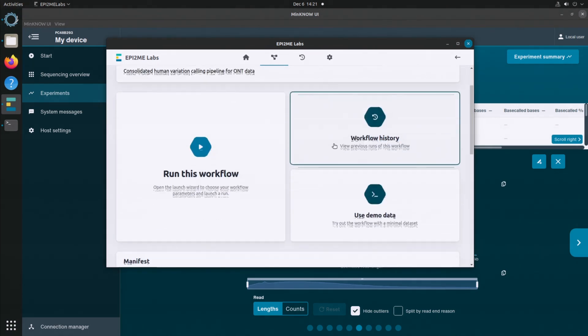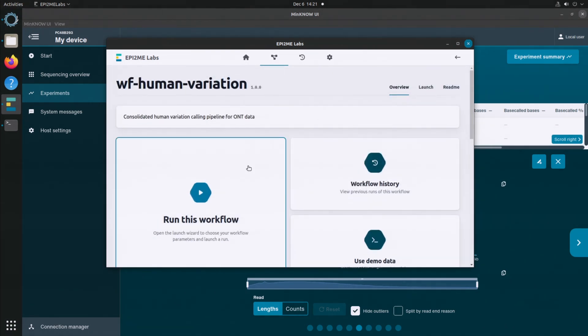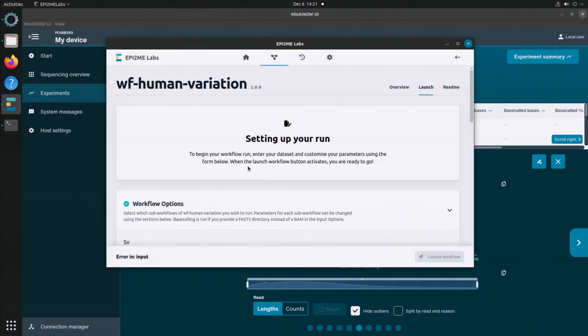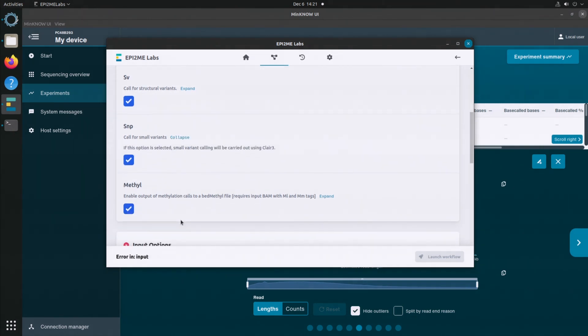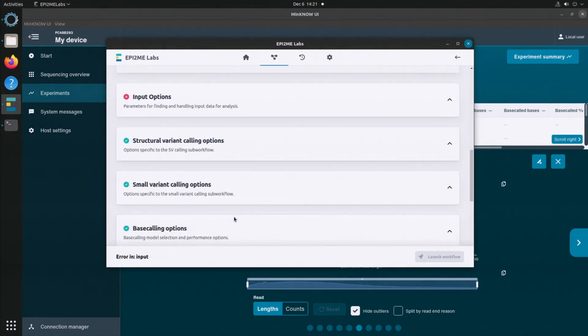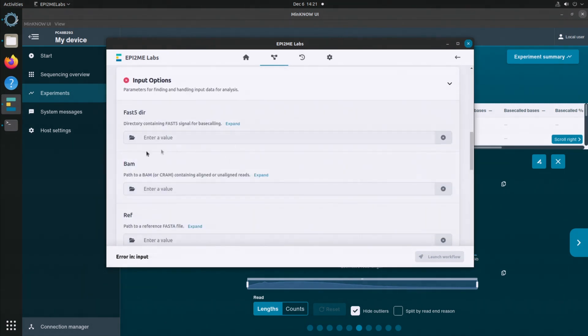Let's begin to configure the beginnings of a workflow. There's a big Run icon — you click it and it opens up a beautiful dialog. We've got simple touch buttons where we can specify the attributes of our run: yes, we want SNPs; yes, we want structural variation; and yes, we want methylation. We scroll down, identify the folder which has our sequence reads, and then there's a button at the bottom to launch our workflow.